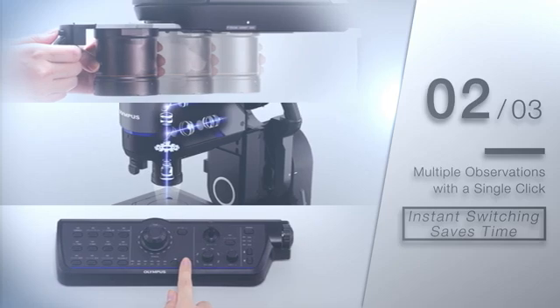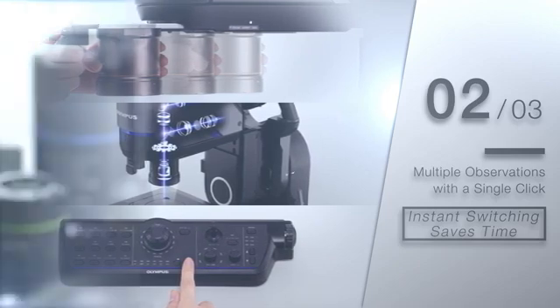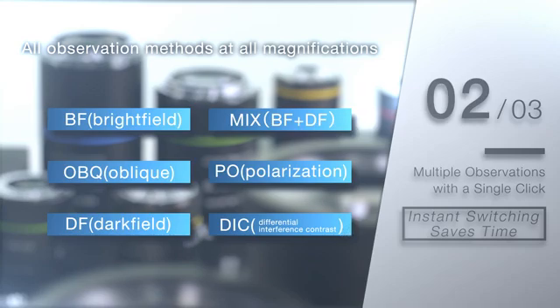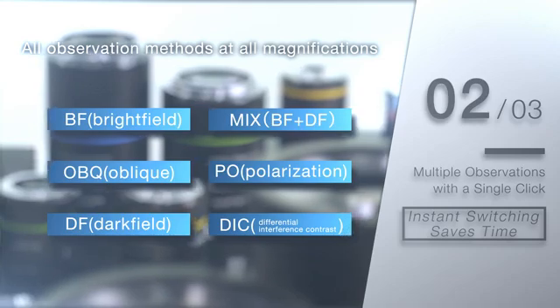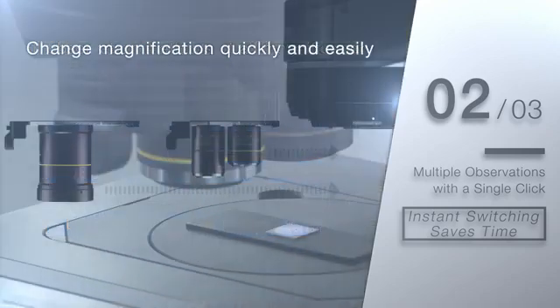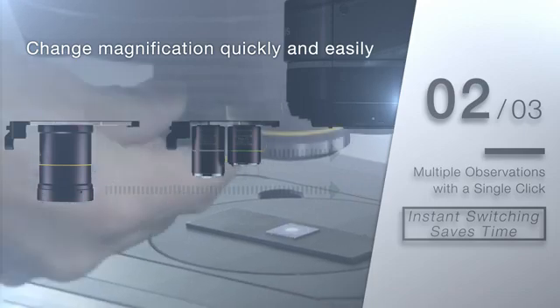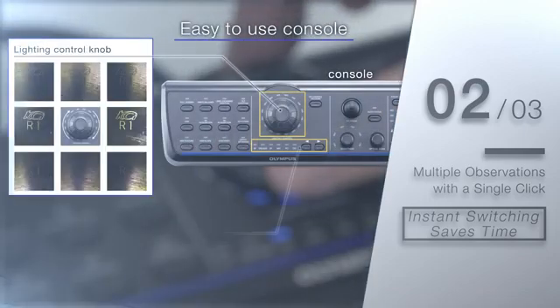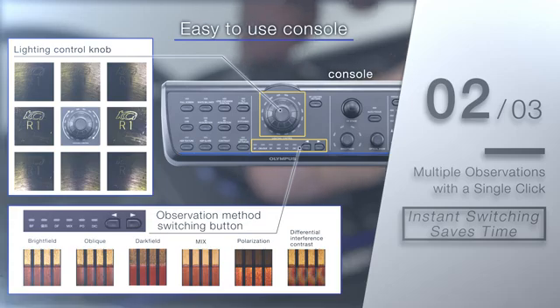Multiple observation methods are also supported. The Best Image function enables you to view your sample under six observation methods on one screen, so you can quickly choose the one that works best. And all magnifications are available in every observation method.